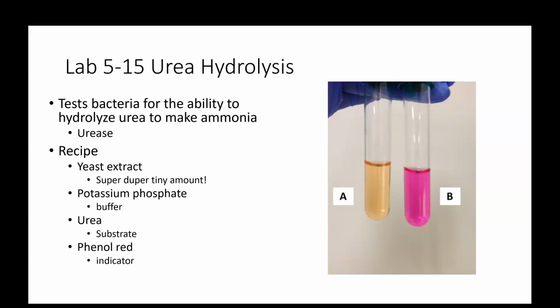The recipe here is almost a defined media. It has a tiny, trace amount of yeast extract in the media. It has a buffer to prevent quick changes in pH. And then, of course, it has our substrate, urea, and our indicator, phenol red.